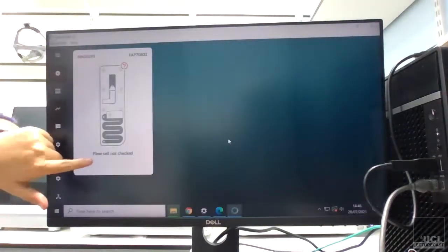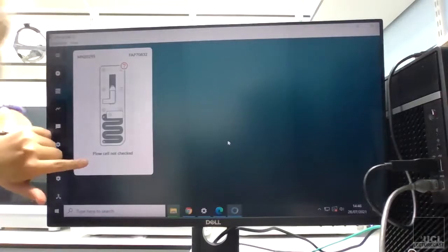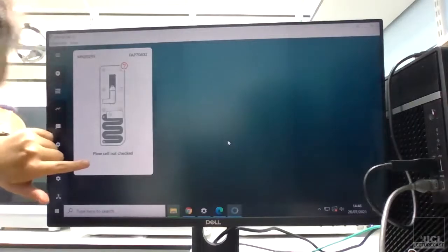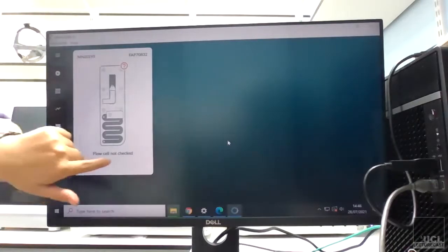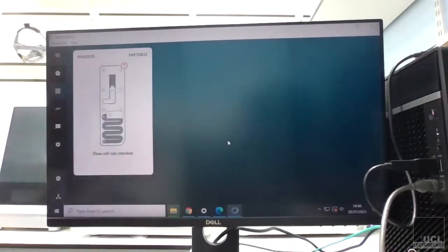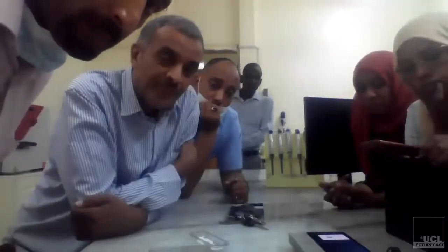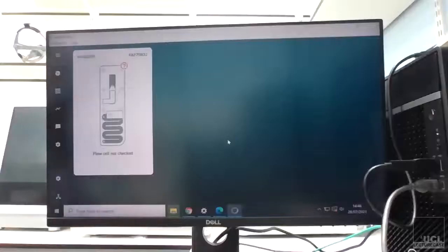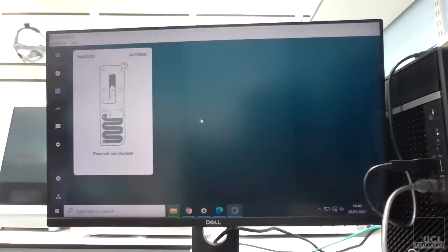And that brings up this panel here, and you can see that it says flow cell not checked. That's because my flow cell, on this computer, we haven't checked the number of pores.